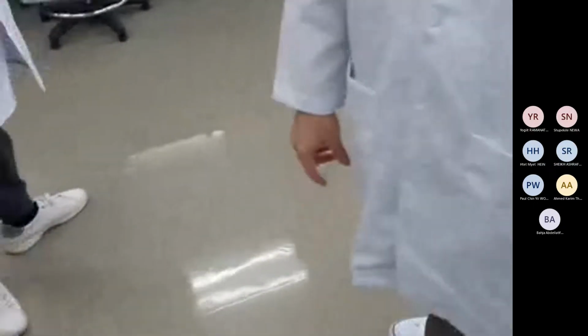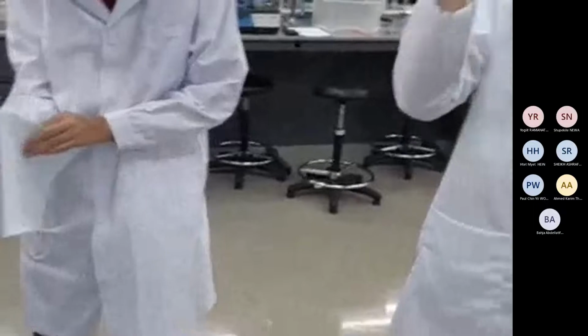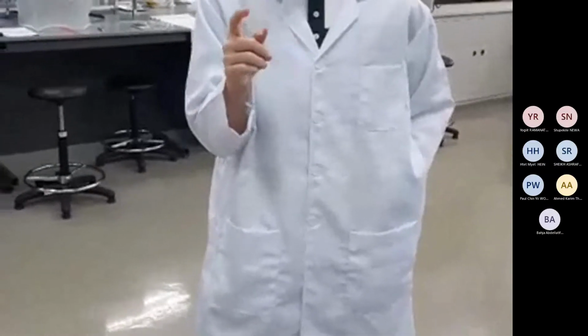Can you hear me, guys? All right. Now, this is the cuvette you have in your hand. My one is a little bit grayish color. You don't want to use that. You want to use the cleanest, most transparent one, because if you use the grayish color, it is going to stop the light from passing through.